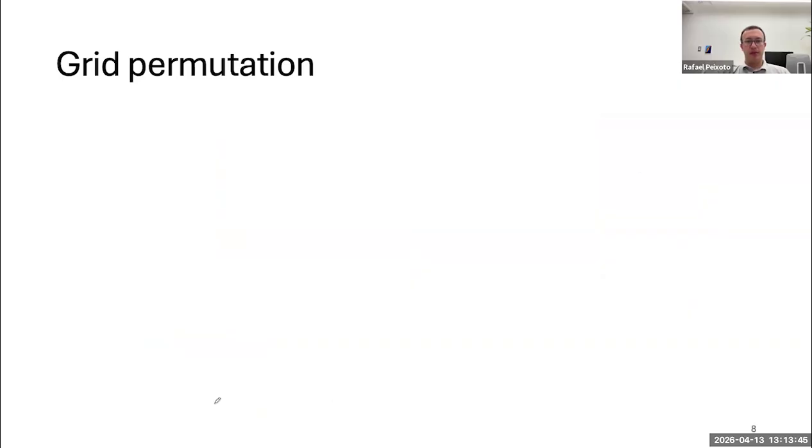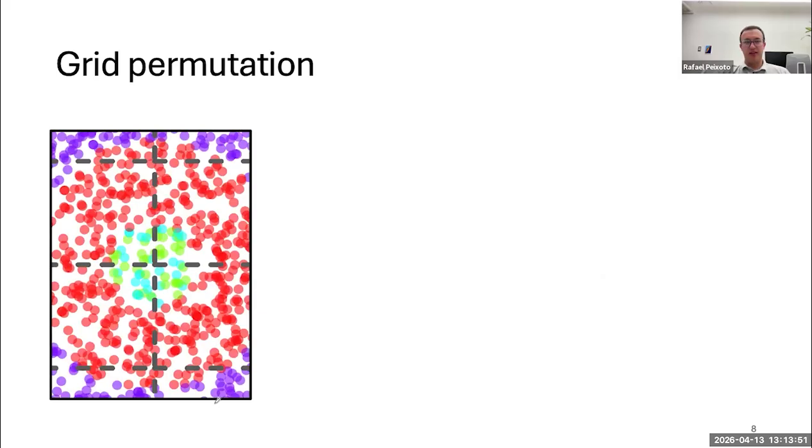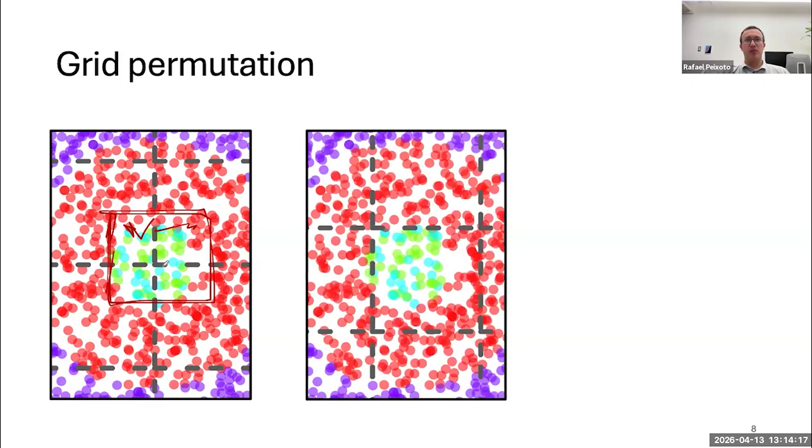But we also do the grid permutation. Another type of permutation that we do, and it is important to clarify, is changing the grid. Sometimes we have a particular structure in the tissue, and by chance the pattern in the tissue matches our grid size. Since we shuffle all the labels only inside the grid, the proportion before and after won't change much because this grid is composed mostly of the same two cell types. So we also perform other shufflings in the data, where we try to change not only the size of the squares, but also the initial starting points of the square.